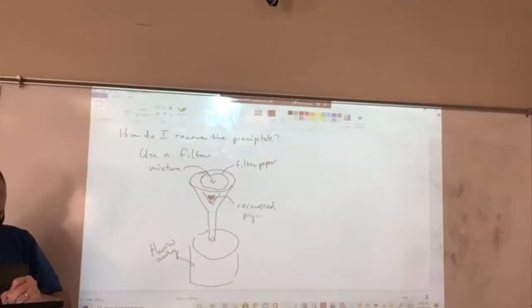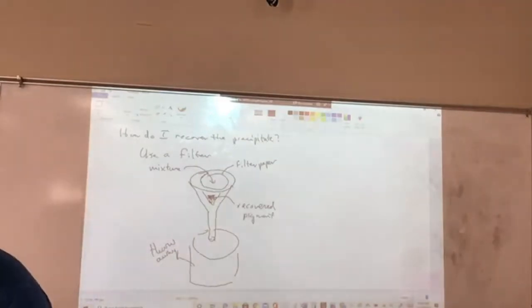Pigment. Okay, so I'm going to show you how we're going to do that. And I will have cut these out. It's cheaper to buy the filter paper in large sheets like this and then just make the filters, so we do that.